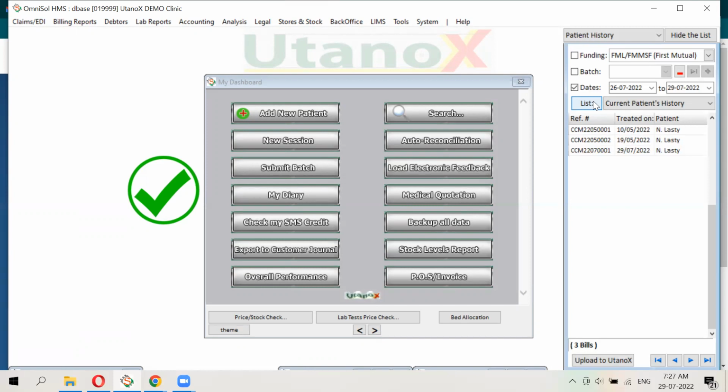Yes, and there are many ways to do that, depending on your infrastructure choices or preferences, or what you already have in terms of your network service provider. If you want, you can provide your own centralized server and wide area network, or we can provide the infrastructure using the hosted solution. You actually have choices within what we already have to accomplish exactly that.